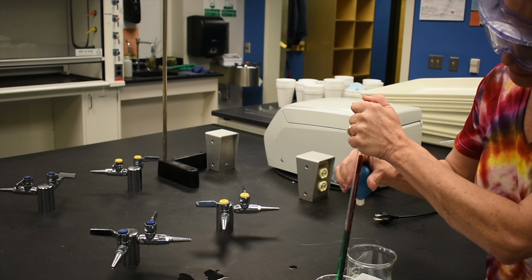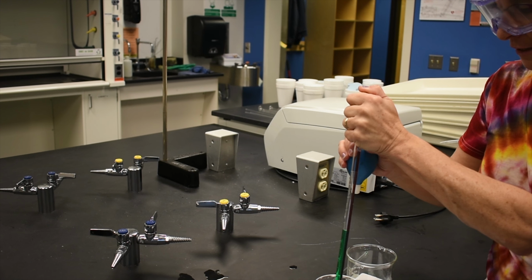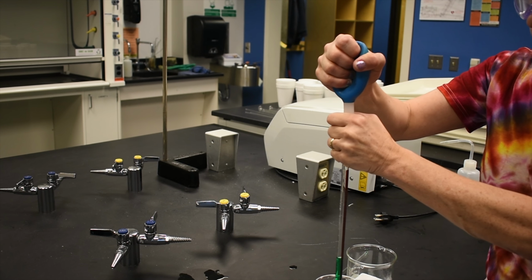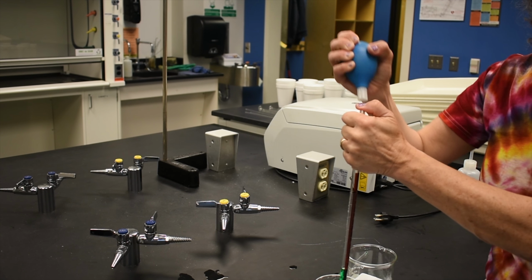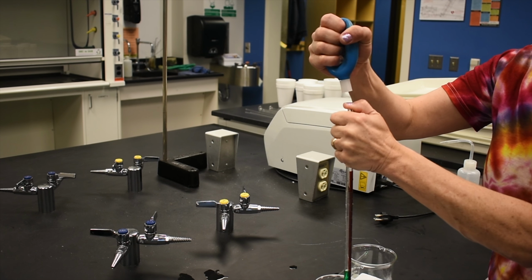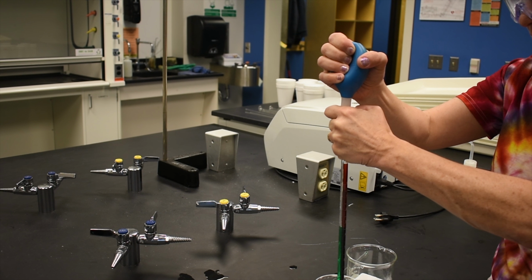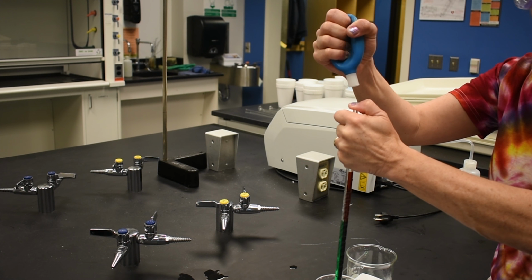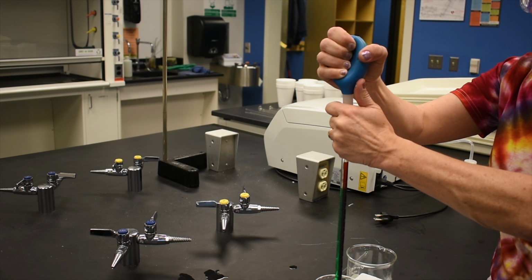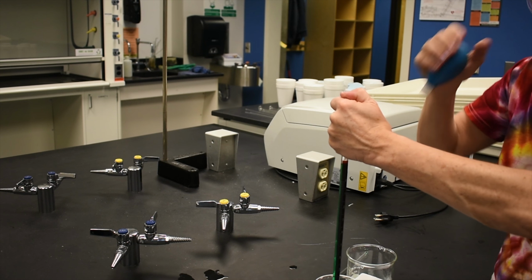Now, as you can see here, the liquid is not all the way to the top of the pipette, so what we want to do is squeeze the pipette bulb out again, place it back onto the pipette, and continue pulling solution up into the pipette. And I'm going to have to do this a third time to get all the way up to the 10 mils.